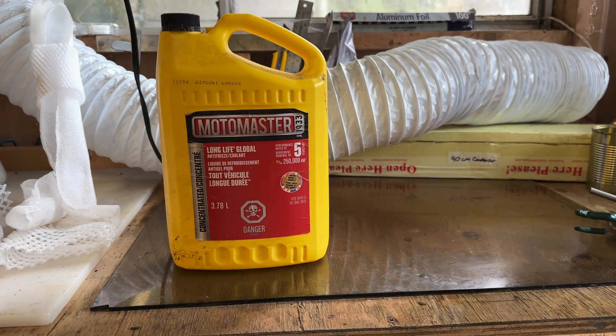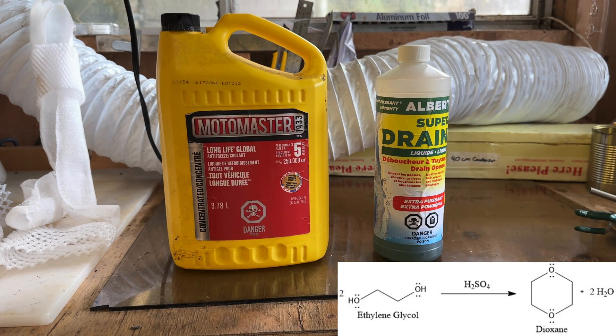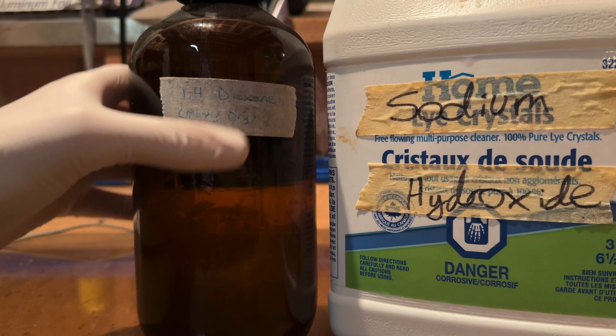Hey guys and welcome back to another video. Today we will be producing some dioxane from ethylene glycol via the acid-catalyzed dehydration of ethylene glycol from antifreeze. Dioxane is a very useful solvent for many reactions and always good to have on hand.